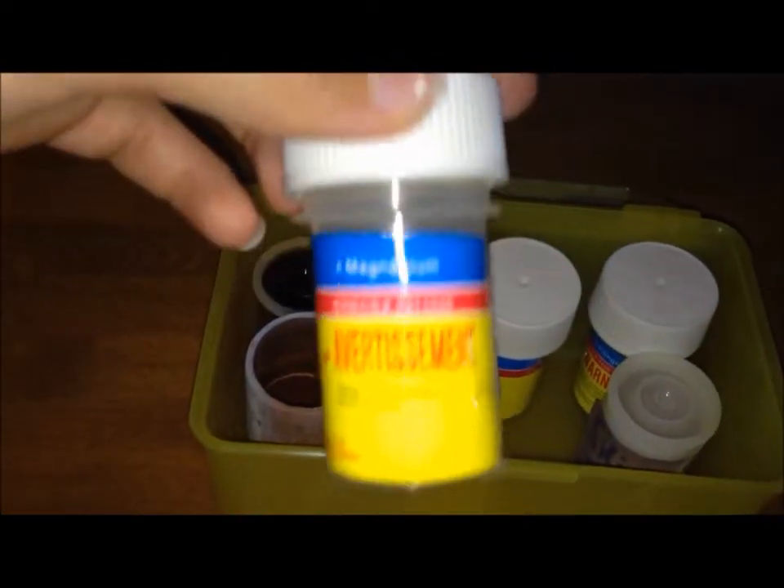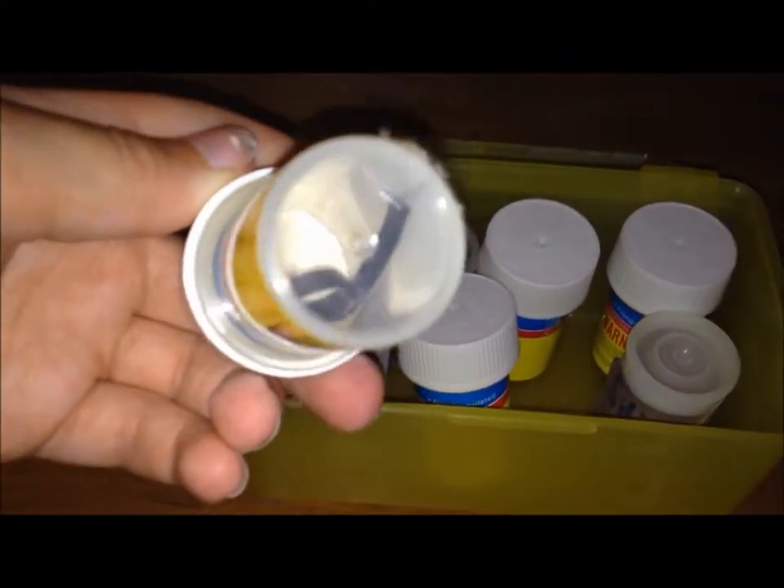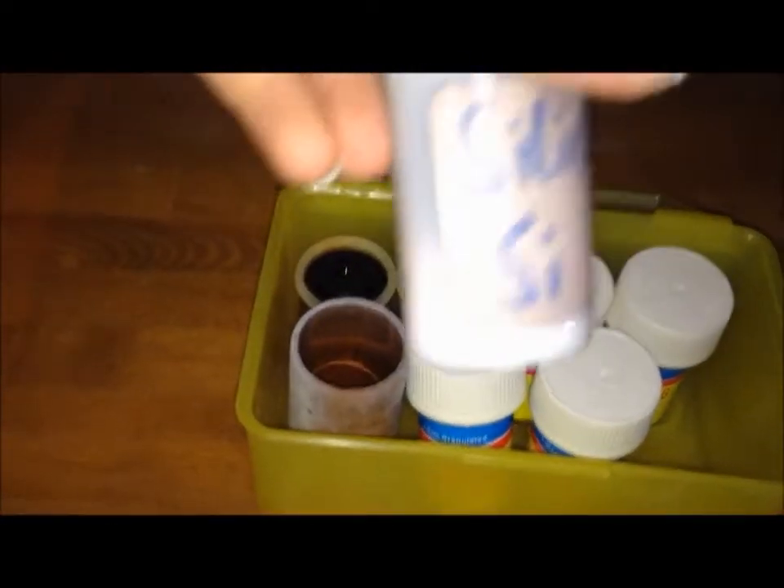Here we have magnesium, just a strip of magnesium — good for fuses. Silica gel, which I'm going to use in a later video to make sodium silicate, which I'm going to use for a crystal garden.